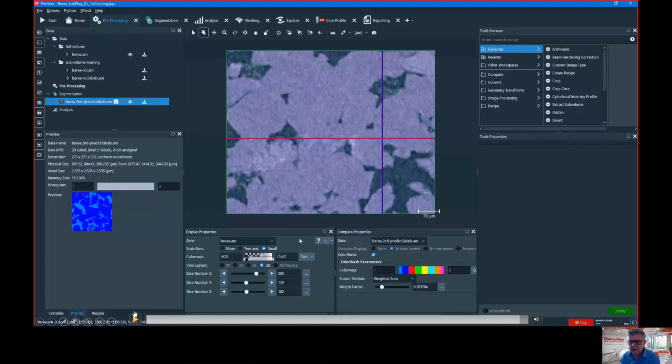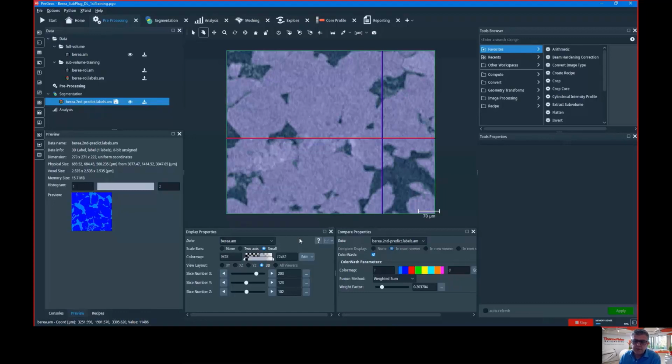But if you remain in the same class, the other option you have is to do a semi-automated recipe. Then every time you will have to ask the user to trim some threshold. So you will need some interaction with the end user.